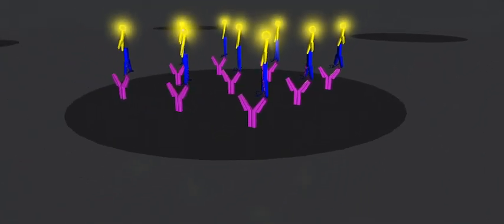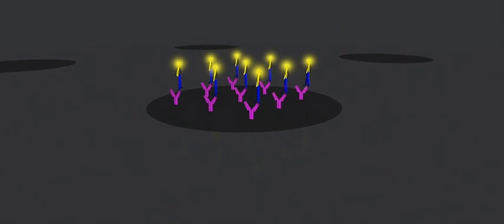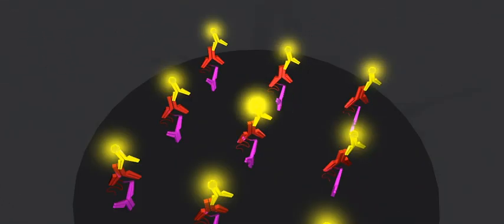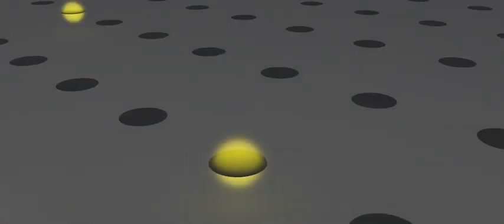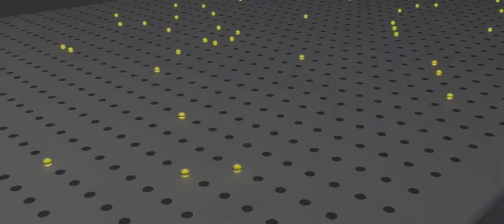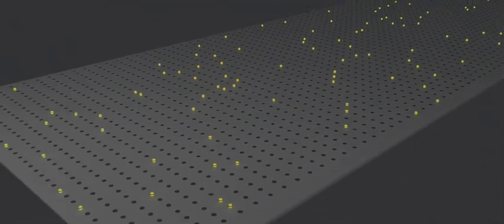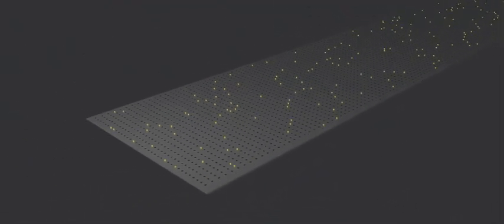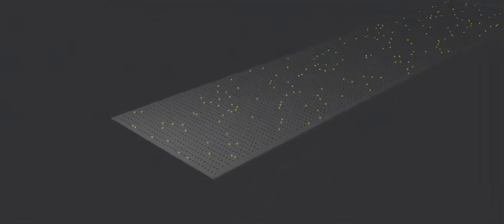Since we know the address of every protein on the array, we know which ones are lighting up and by looking at the lighting patterns from many different patients, we can learn which ones are key to early disease detection.